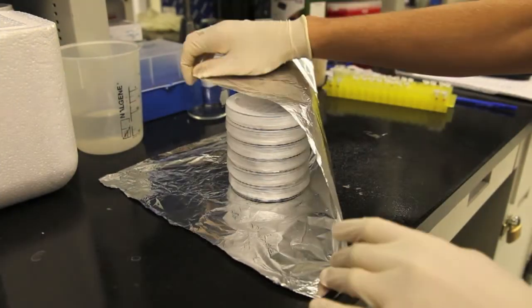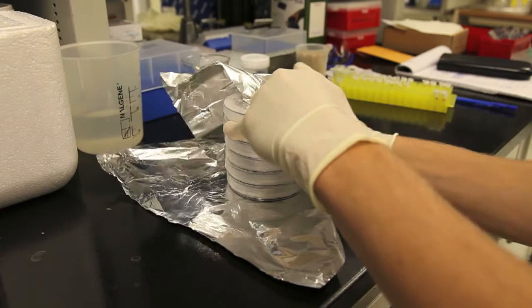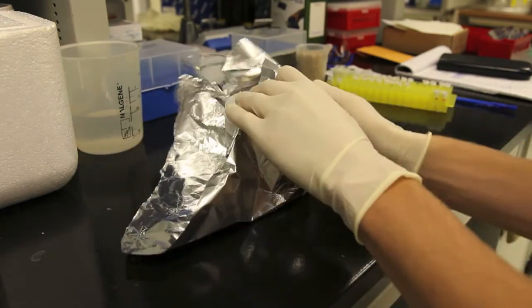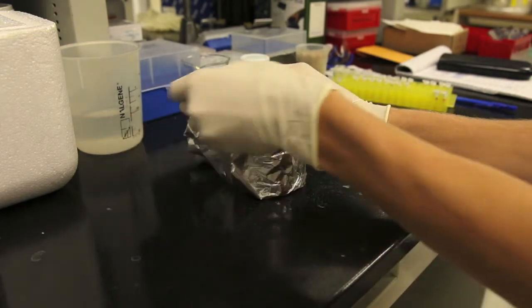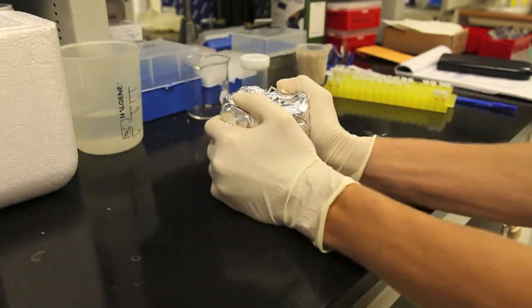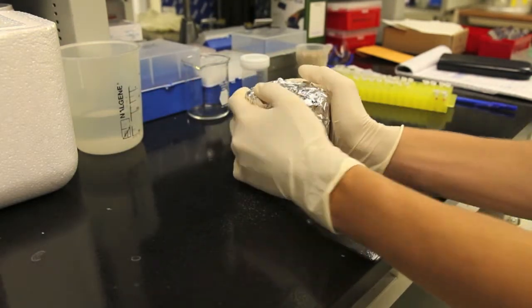Once you're done preparing your plates, stack them and wrap them in aluminum foil. This will keep them in the dark during the cold treatment you're going to subject them to. The cold treatment is known as stratification and it's an important step in breaking seed dormancy and synchronizing seed germination.